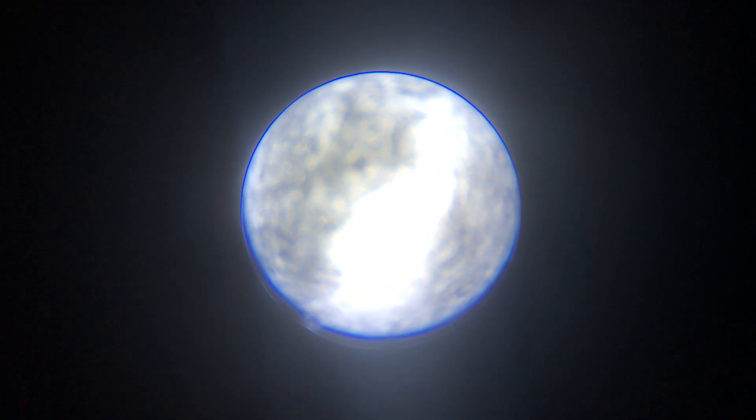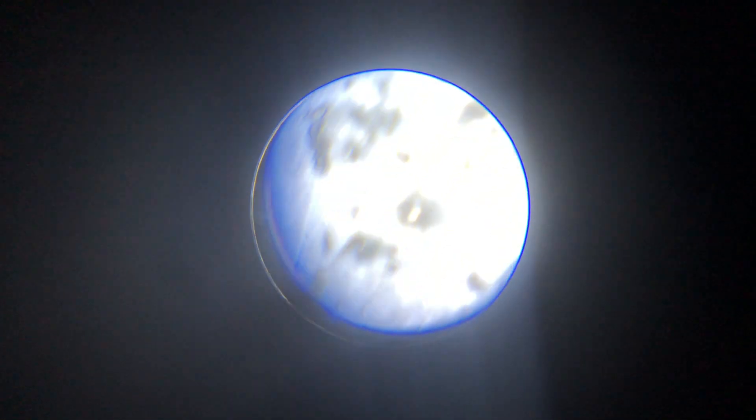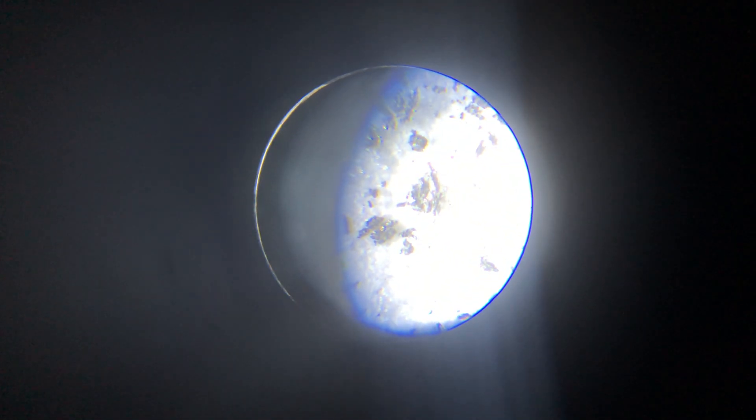The structure of graphene oxide looks like little jagged razor blades — it's really sharp and jagged. So here's the lead graphene. I'm going to go over where I wrote with the pencil, because that's the thinnest layer. Now let's go to the powdered substance. This is kind of similar — you notice the jagged structure of these.